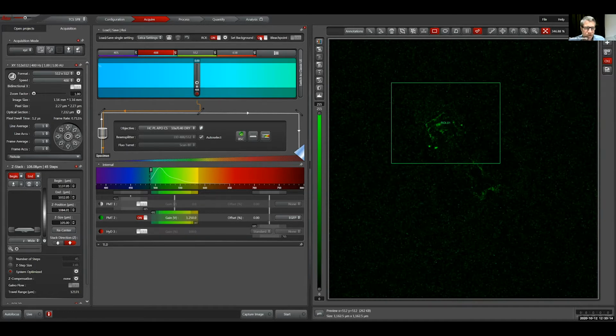And then if I go to the region of interest, oh, good. Look, see how the laser power is at 4? Yeah. That says the region of interest is going to be at 4. Now I go to set the background and I say anything that's not the region of interest, I want to be 0. Okay. So outside of that green rectangle, that is laser power 0.